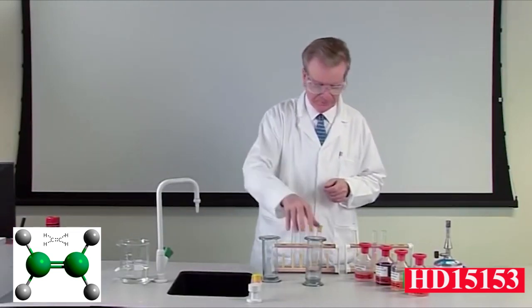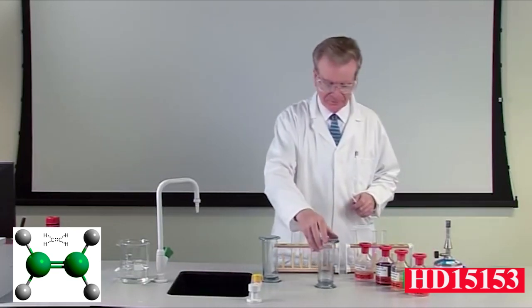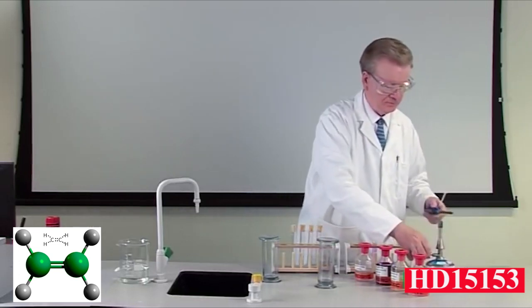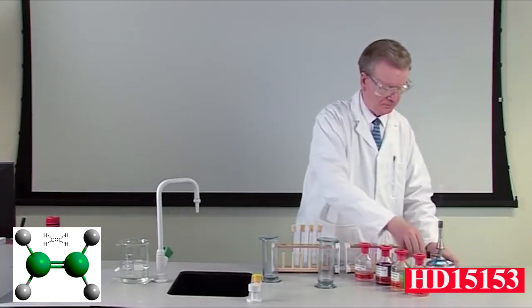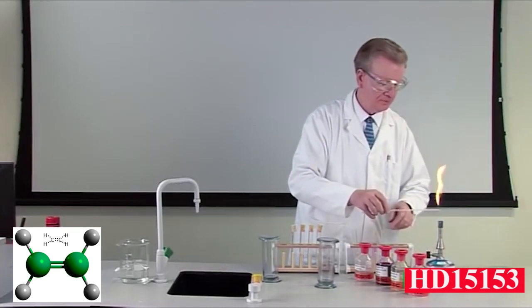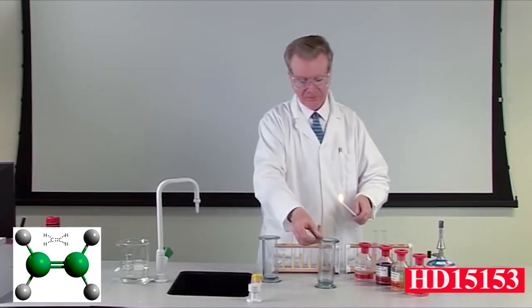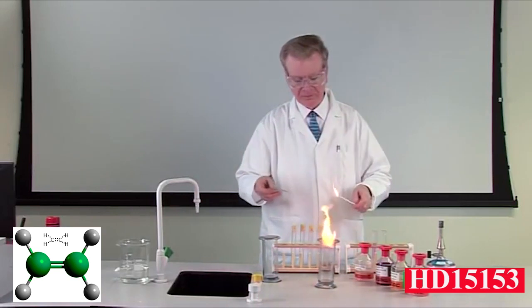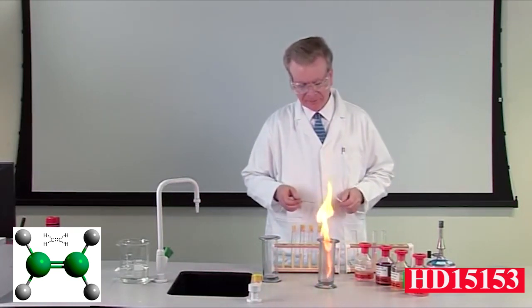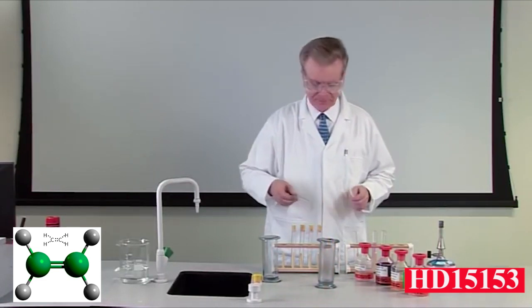We now investigate what happens when we burn ethene. Remove the lid from one of the gas jars and use a lighted wax taper. Apply a light to the mouth of the gas jar. Note that the gas burns with a luminous flame. Allow the gas to burn.